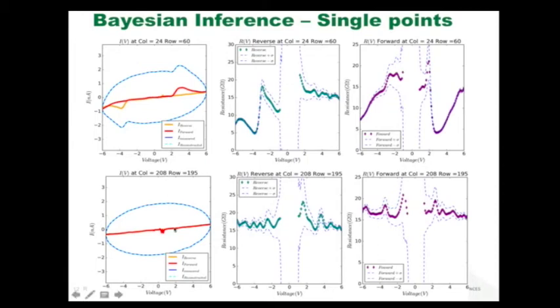And if you're actually over the bare film itself, you're not able to see it because the current over the bare film is much smaller, because the contact area is basically given by the AFM tip in that case. And of course, if you have a very small contact area, then the polarization that you're measuring is smaller effectively. And so therefore, the current that is generated from that polarization reversal is typically below femtoamp levels, and so you won't be able to measure that. But on a nanocapacitor, the contact area is much larger, and so you measure much larger currents, and we're able to see these switching currents.